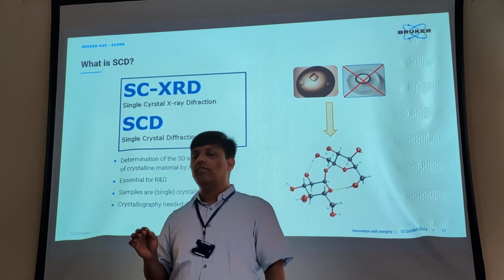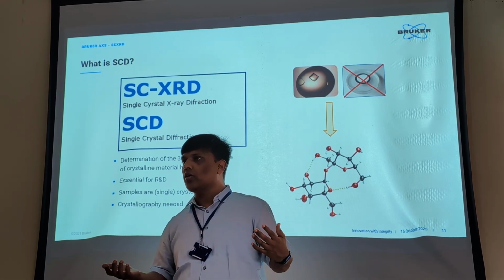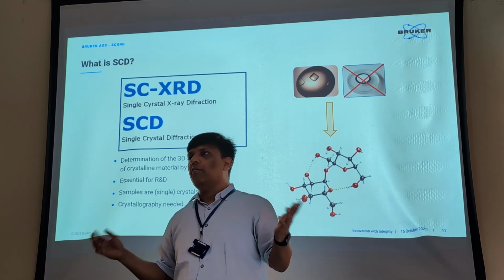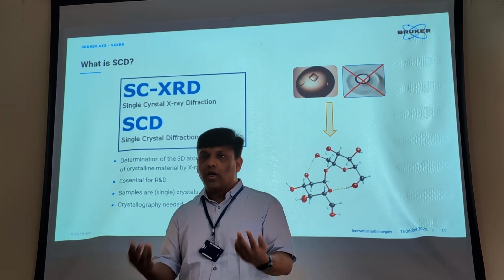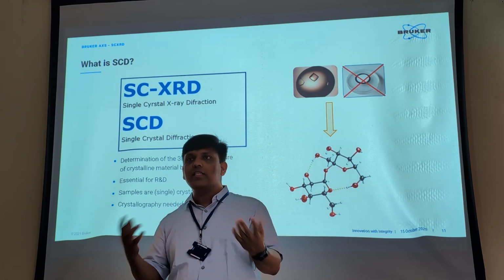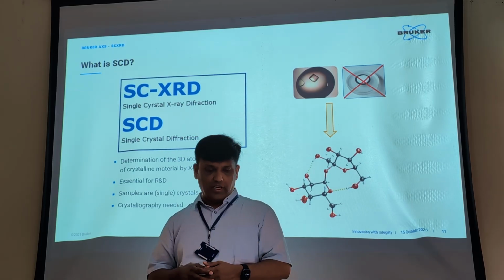Nowadays with the software, 90% of the thing will be taken care of by the software. Okay? You don't really have to learn what is crystallography and so on, because it's not the time now for all those things. But some knowledge about at least what the crystal systems are and how I can solve my structure, a little bit of simple understanding of crystallography, will help you to solve your structure in very fast time.